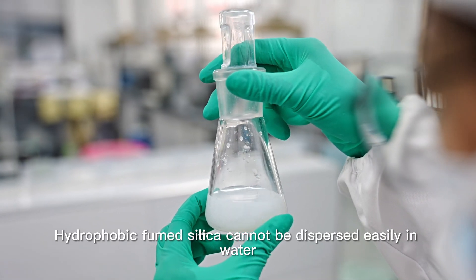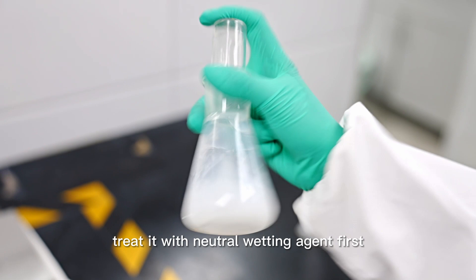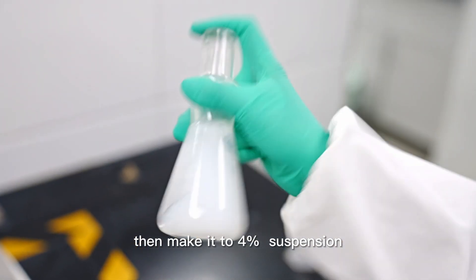Hydrophobic fumed silica cannot be dispersed easily in water. Treat it with a neutral wetting agent first, then make it into a 4% suspension.